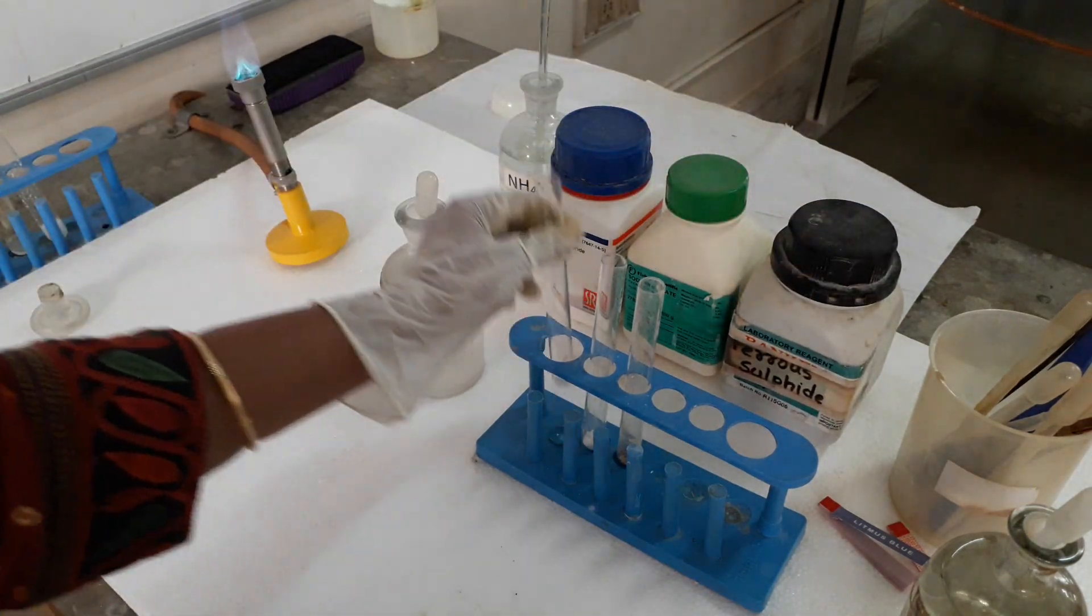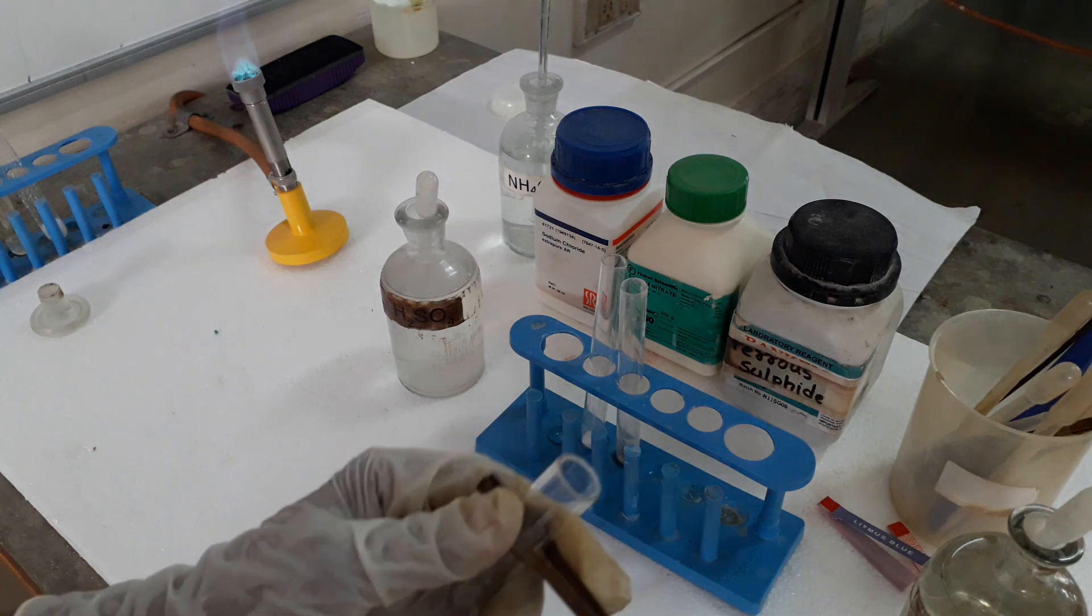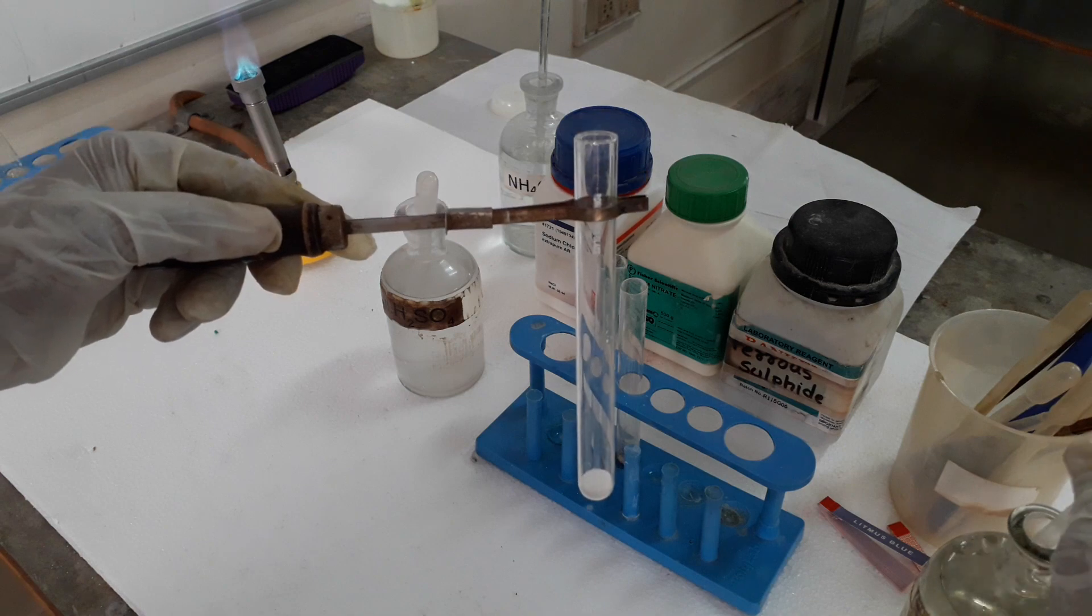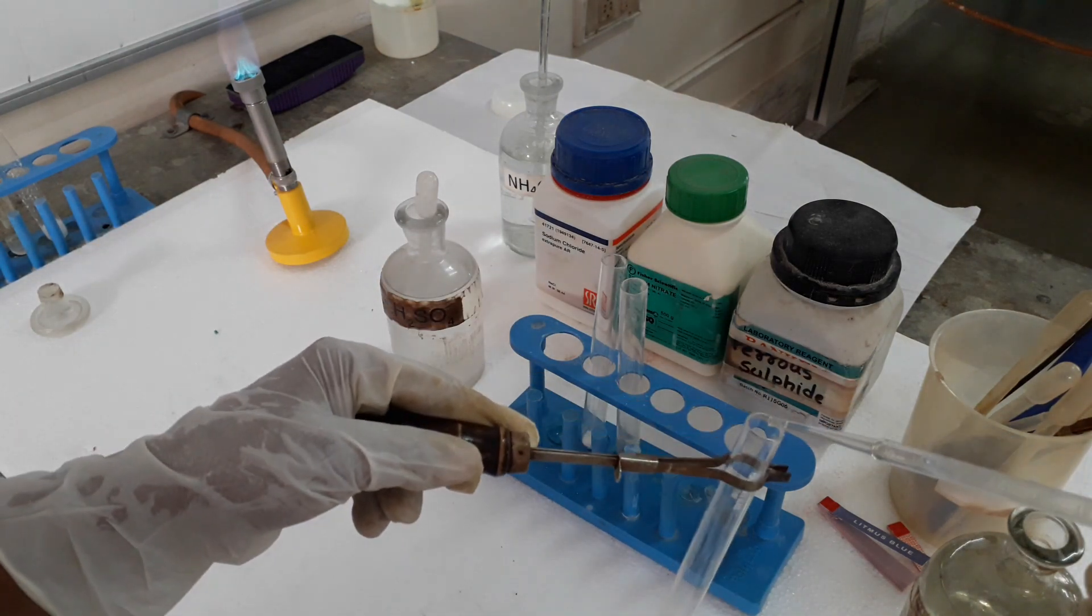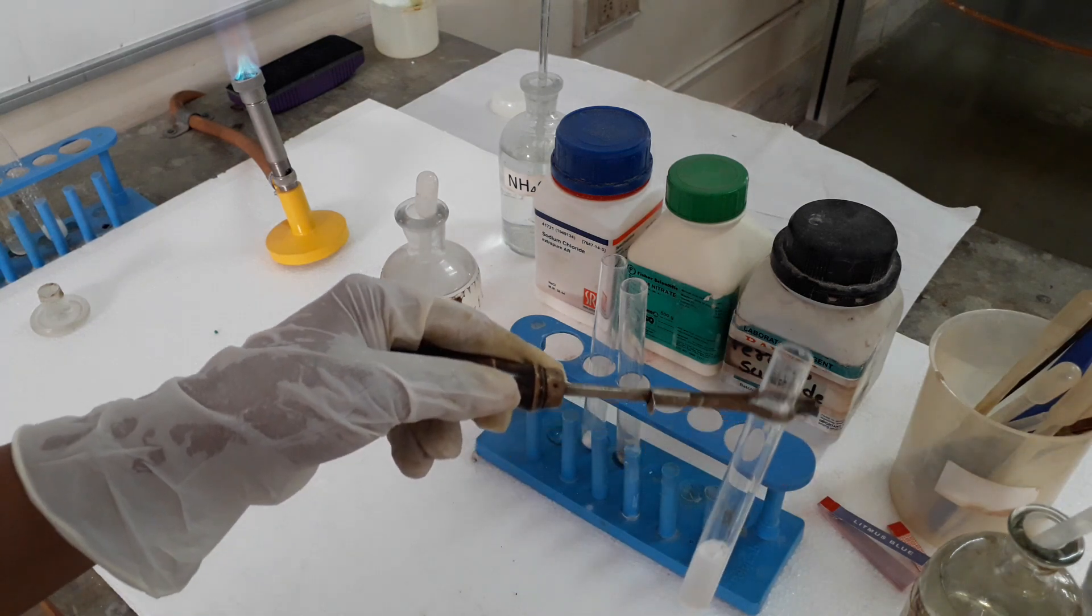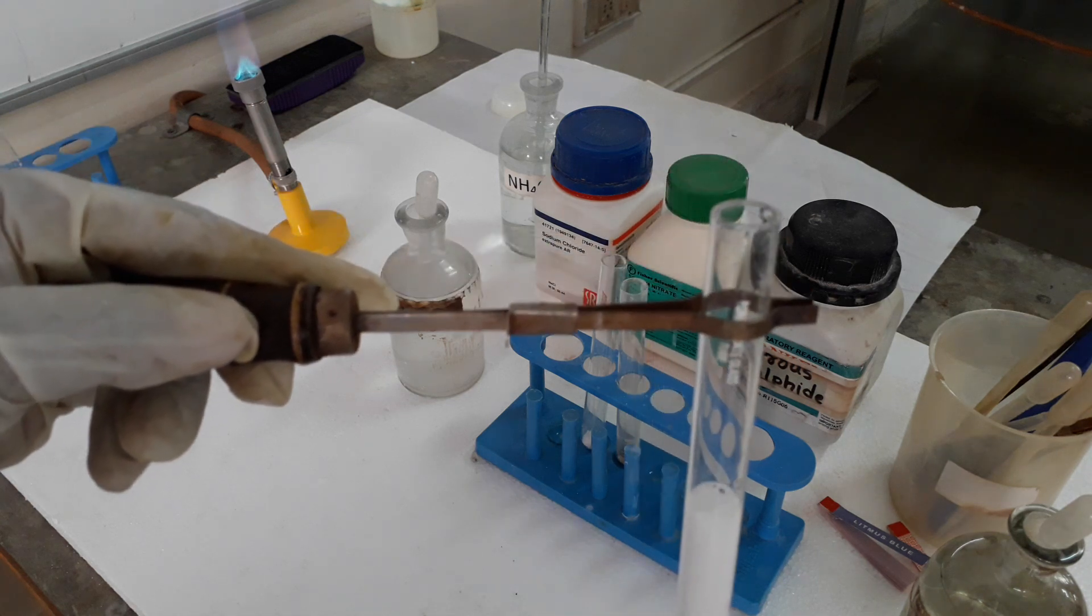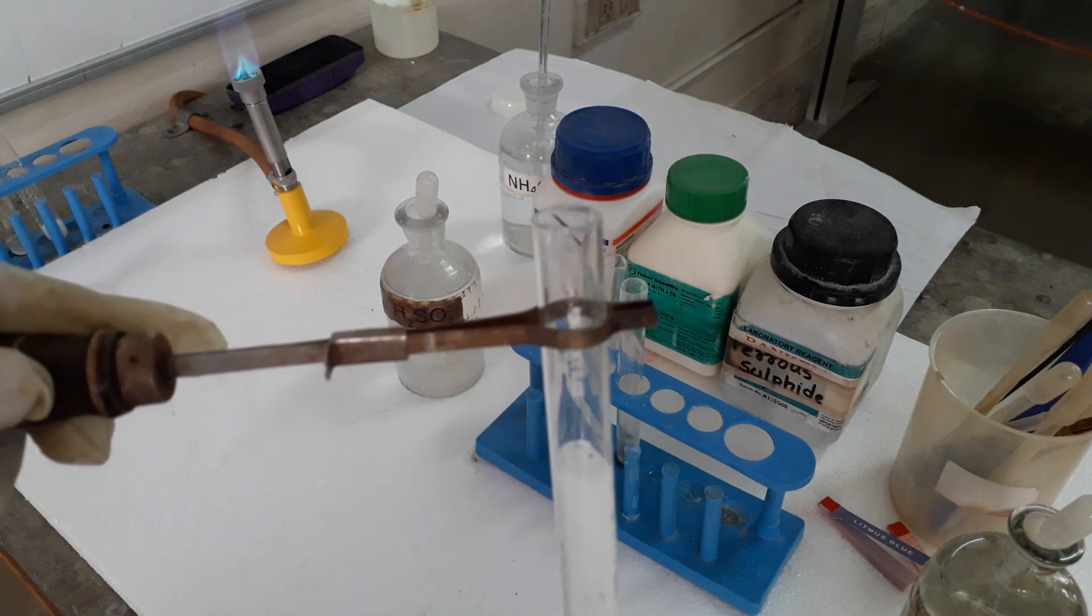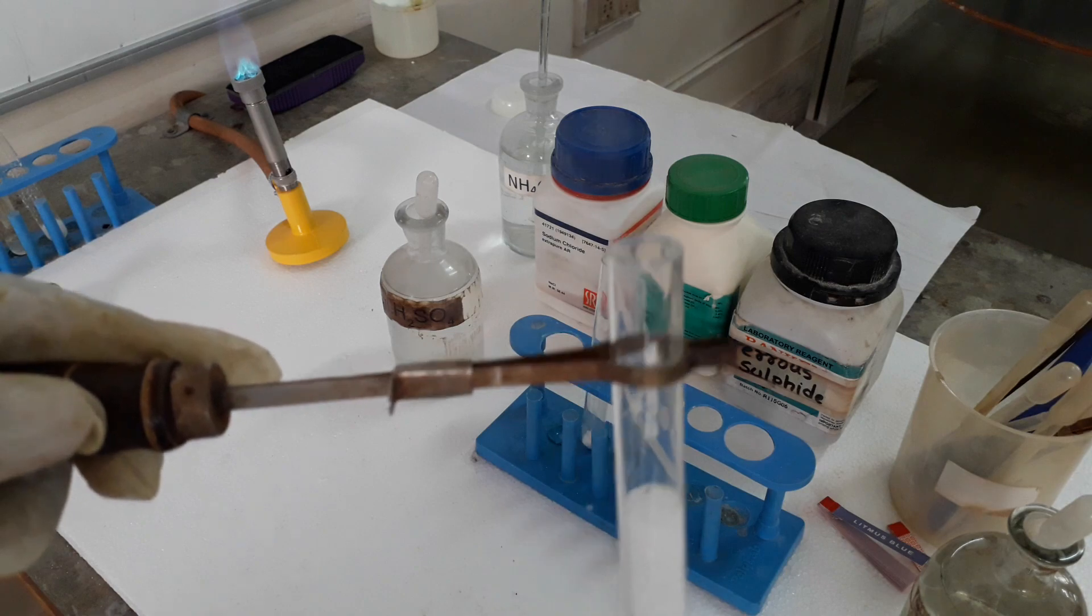First I am taking chloride, and we will be using a test tube holder for this. Let us add concentrated sulfuric acid. The first three anions were detected by dilute sulfuric acid, now these three will be detected by concentrated sulfuric acid. You will see that fumes started coming out from the test tube. These are HCl gas fumes in moist air.